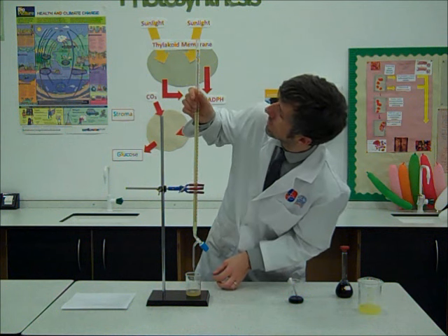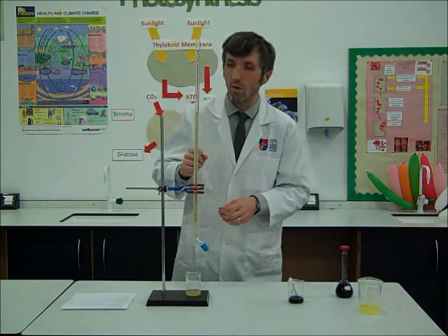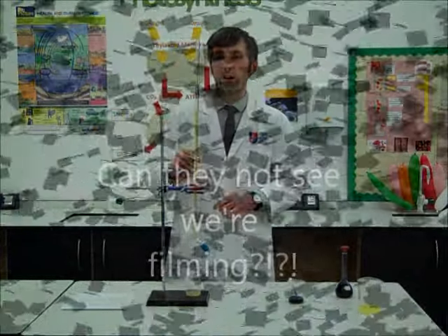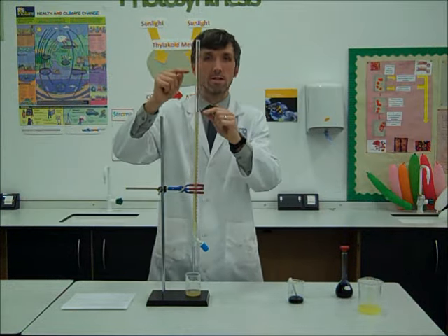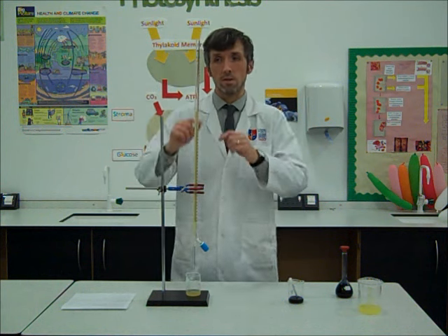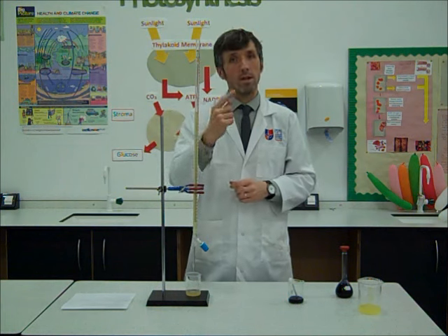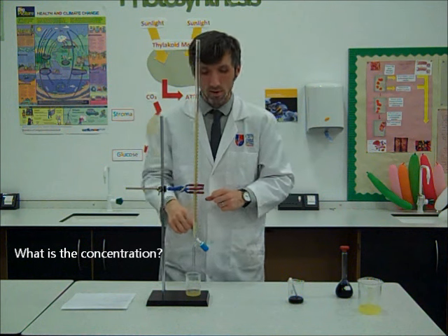It's about 15.4. We've got 15.4 as the volume. We know that in there there was 6mg of vitamin C needed to decolorize the DC-PIP. So we can now find the concentration by doing 6mg divided by the volume, and that will give us the concentration of the fruit juice.